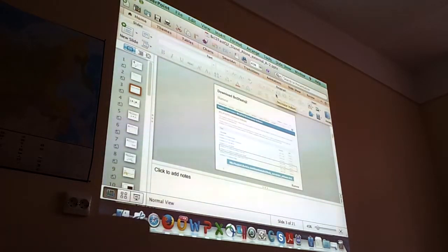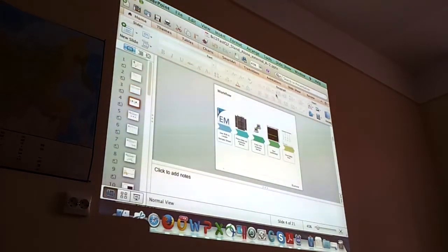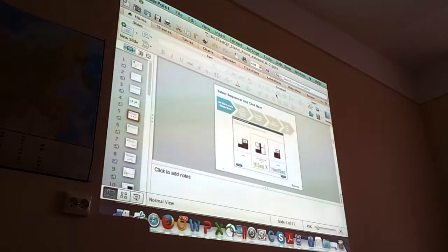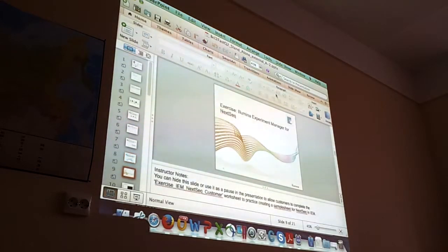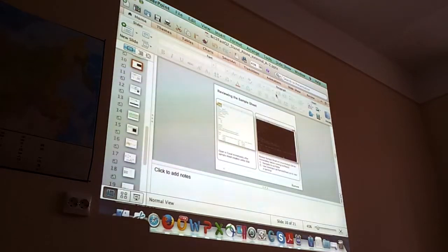So if in future you need BCL to FASTQ, you can just download it from the website. It will be a Linux script, so you need a Linux machine for this, and I suppose you need a strong Linux machine because it's about converting hundreds of gigabytes of text data, which sounds to me like a decent amount of work. Yes. Okay.